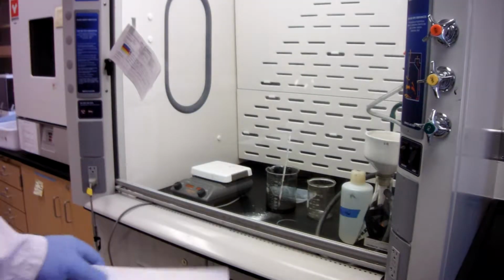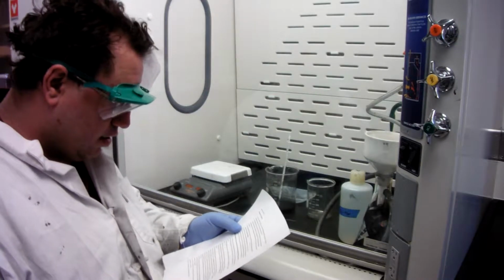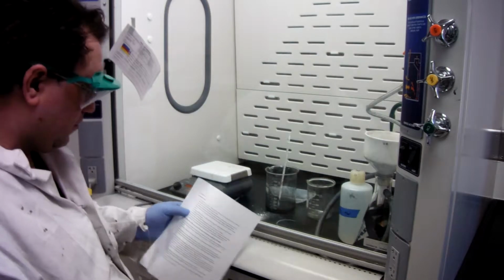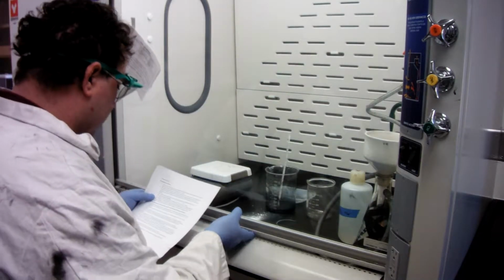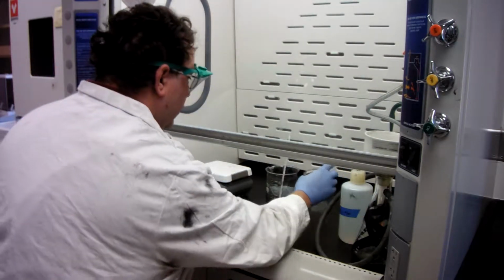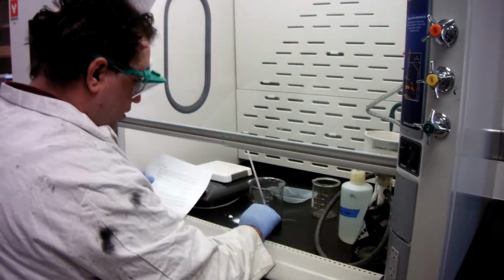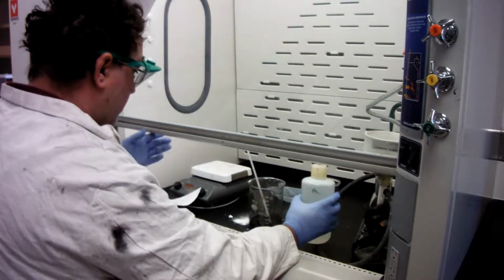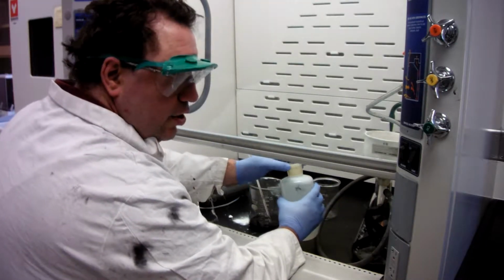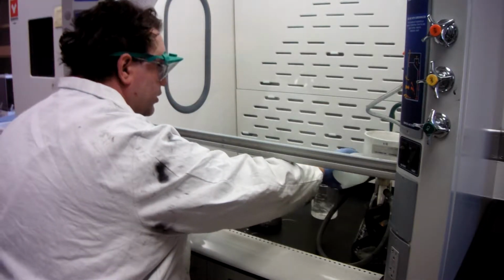Okay, recording. This is the number 3 step where we are cooling to room temperature, to a number 4 step where we're going to mix with the distilled water to 2/3 of the flask. Since I am using this, I'm going to fill this up to approximately 700 to 800 milliliters with DI water. The thing with DI water and sulfuric acid is it will heat up fairly quickly, so either A, drop it in, or B, put a lot in at once to cool the reactions.